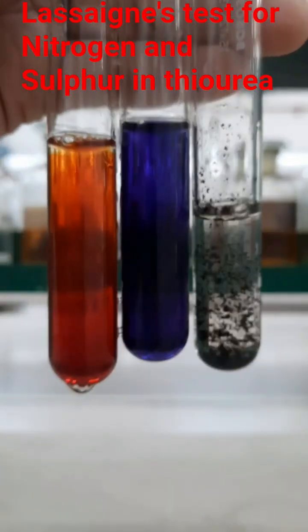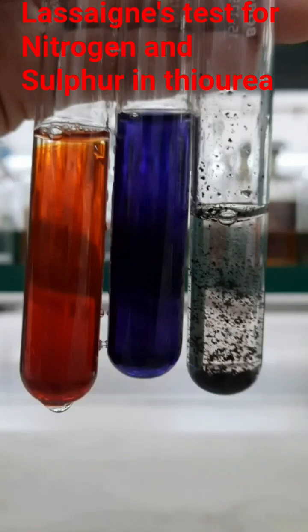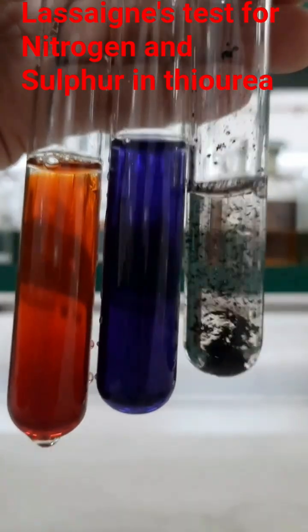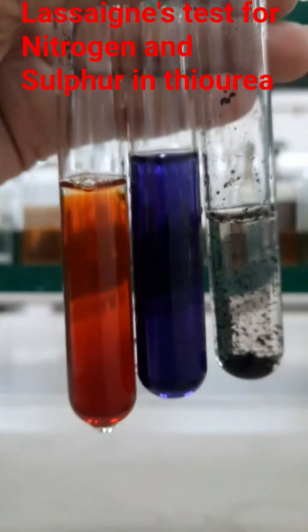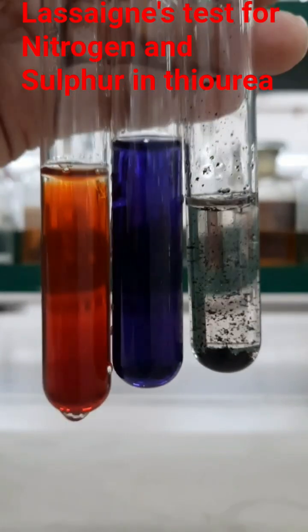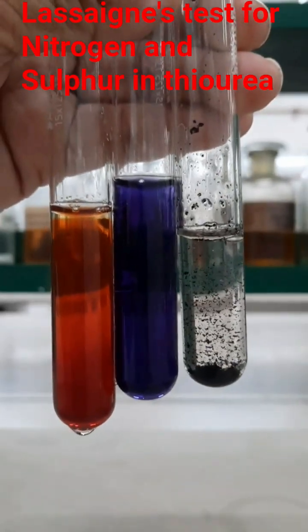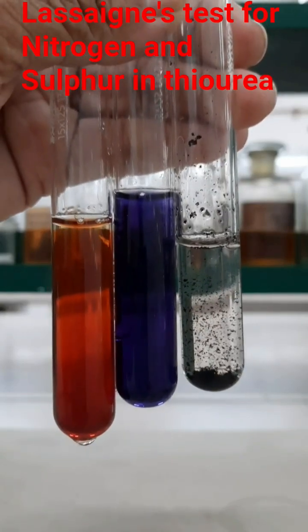In the third test tube, blood red color appears due to the formation of ferric thiocyanate complex. You can see the black precipitate of lead sulfide in the sodium fusion extract due to the addition of lead acetate solution. In the second test tube, after adding sodium nitroprusside solution, sodium sulfonitroprusside complex is formed, which is purple in color.